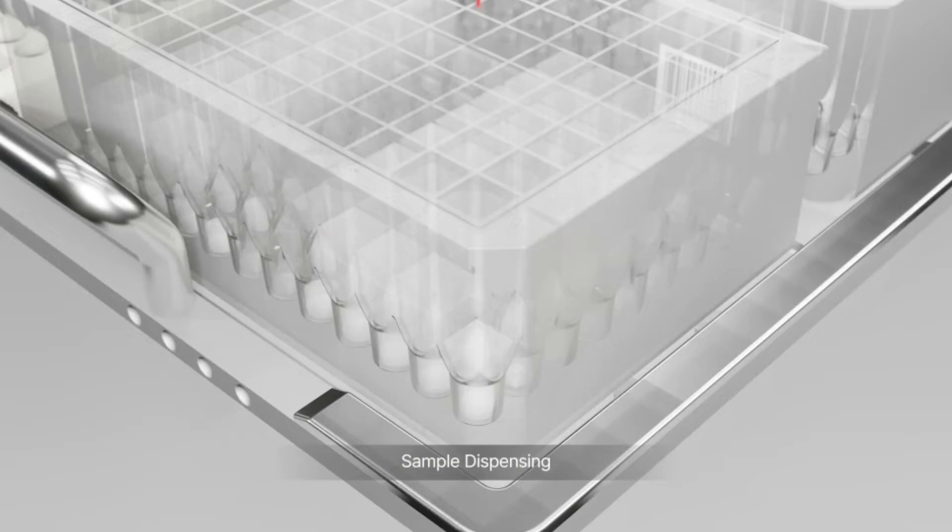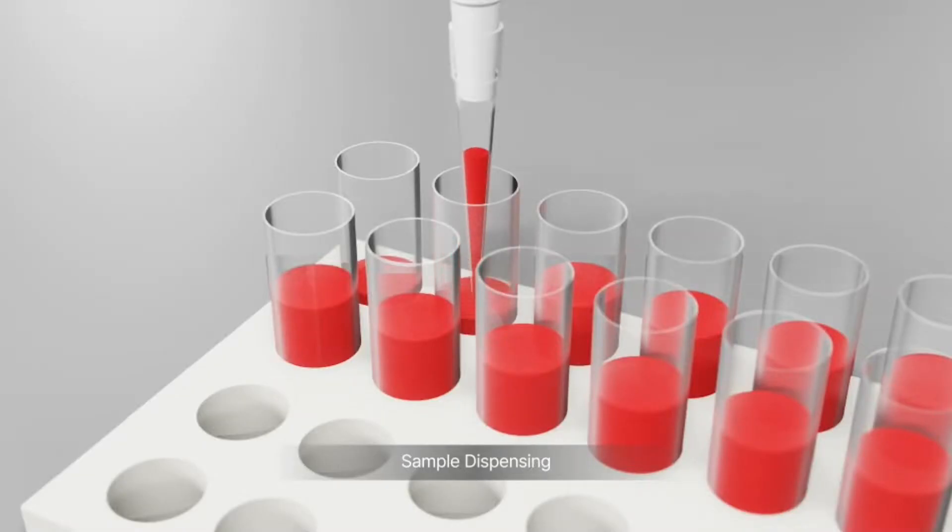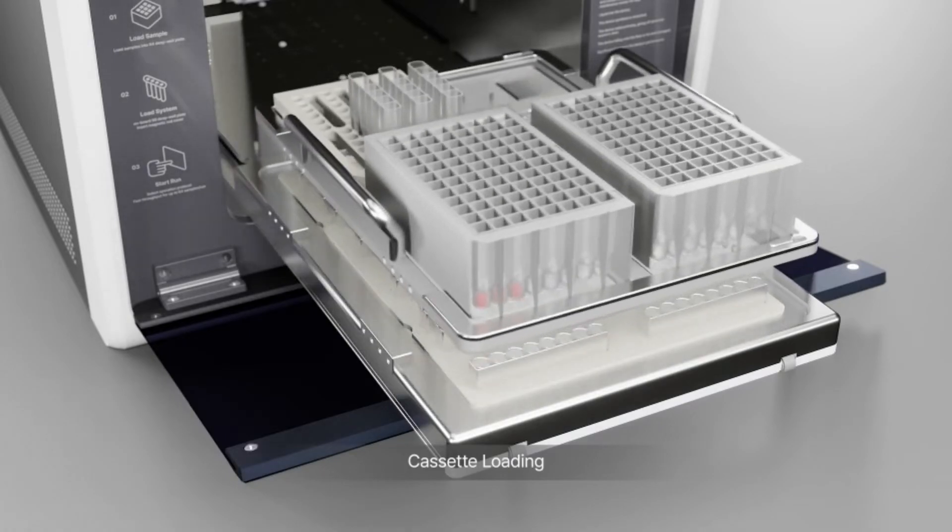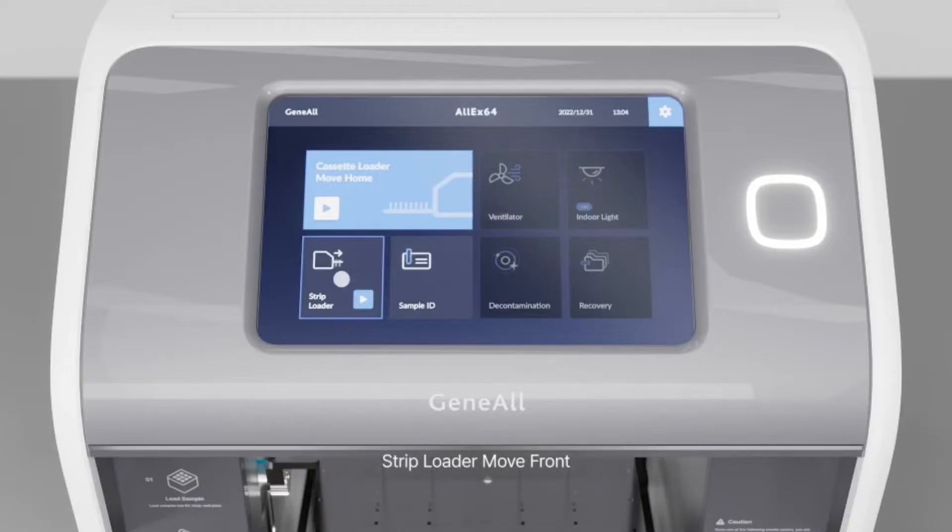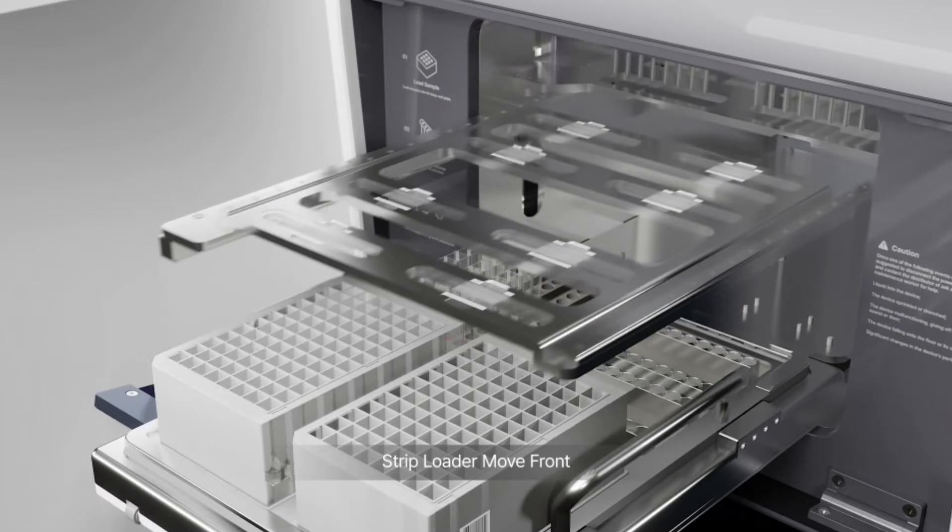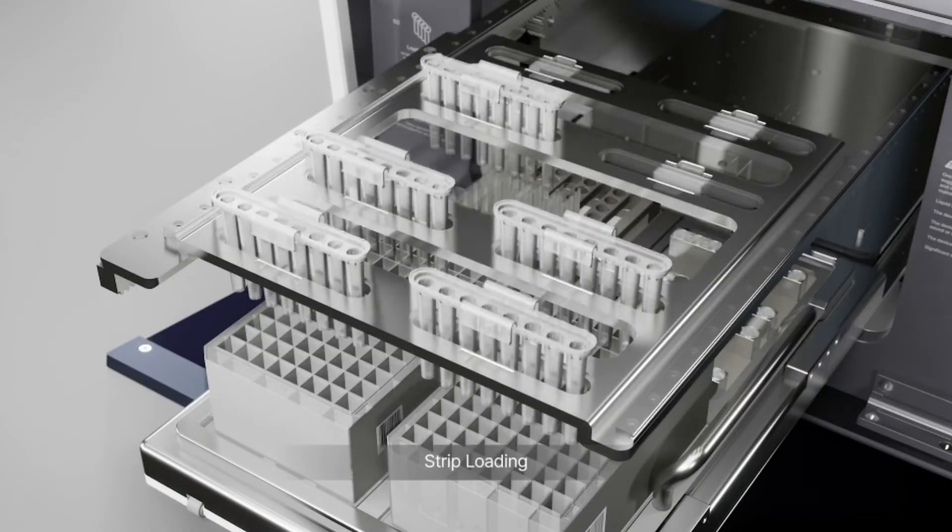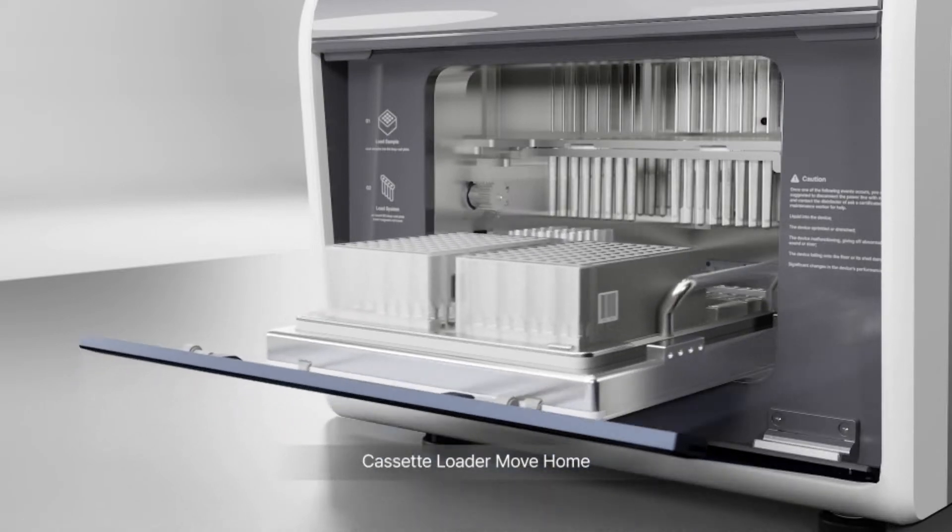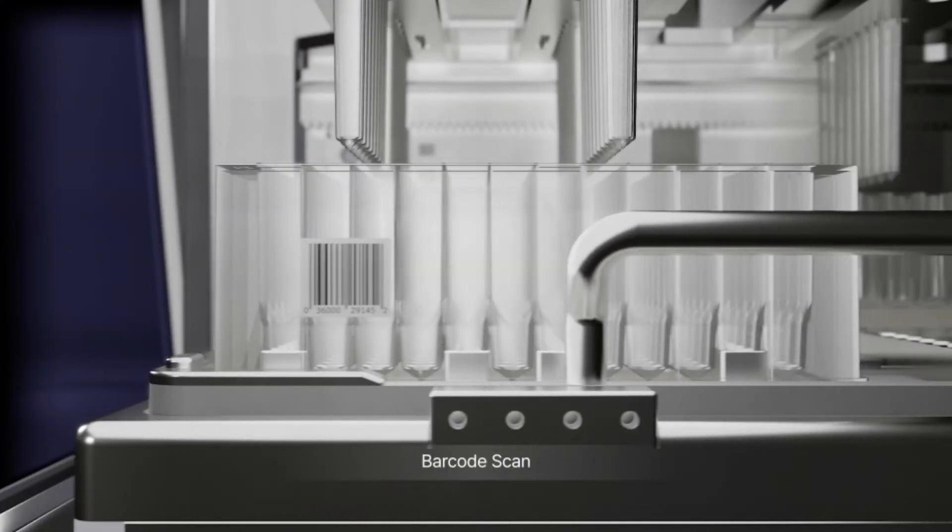After adding the sample to the cartridge, users can simply load the cassette loader to the instrument. The automatic strip loader moves to the front, facilitating loading strips and eliminating the potential of missed strips.